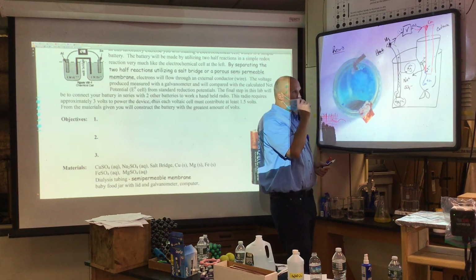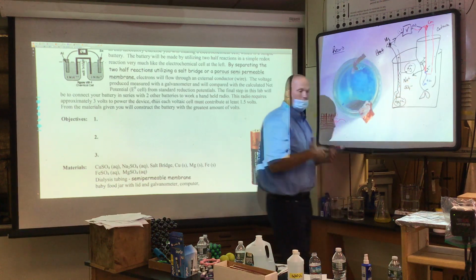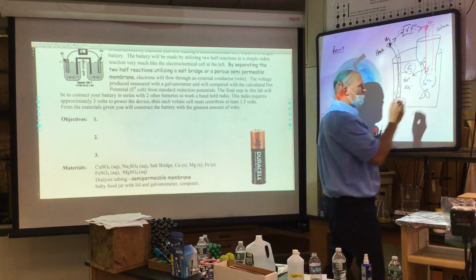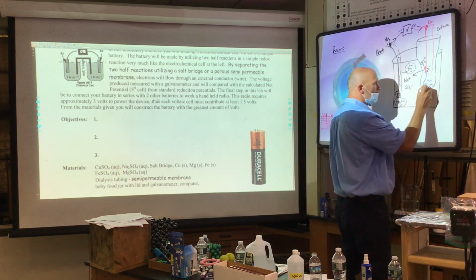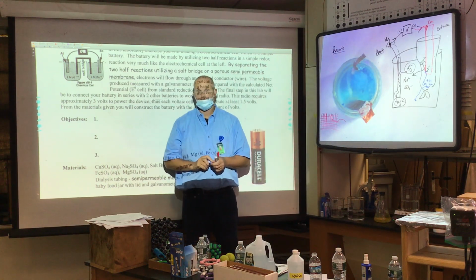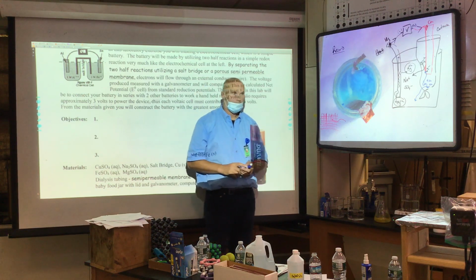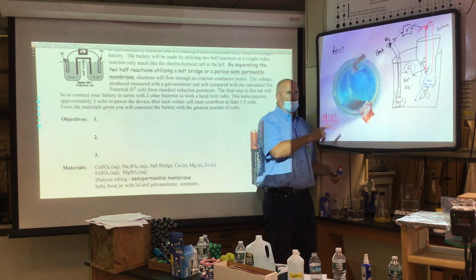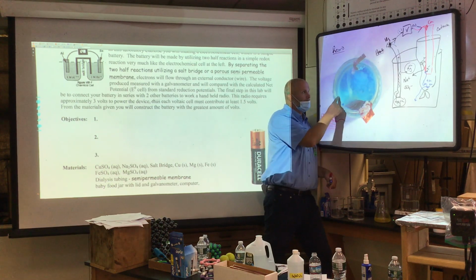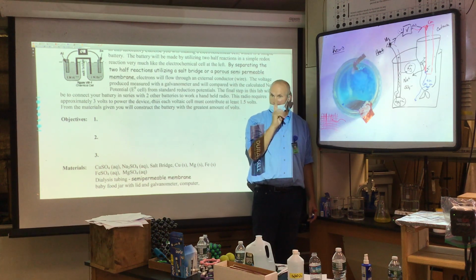And oppositely, in this side, we're losing copper 2+ ions. Probably for 2 reasons. Number 1, copper 2+ is what? Diffusing this way. Why would it do that? Well, because it's going from high concentration to low. So some of the copper is leaving us. And is there any proof that the copper left the bag? Yeah, the entire solution is blue. And we'll talk about that problem.